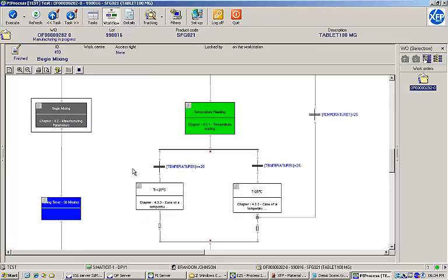You can see that the wait element has been activated and will not allow the workflow to continue until the specified time limit has been reached. While we're mixing, let's move on to the temperature reading task.